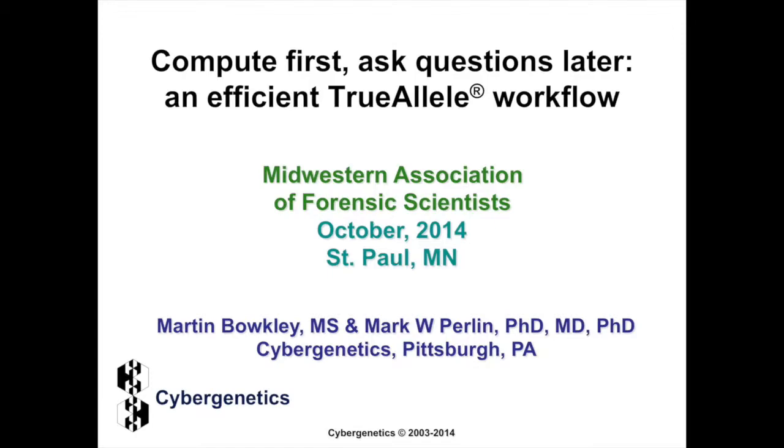I'm just going to be talking about how TrueAllele can be an efficient workflow and how you can compute first and then ask questions later.